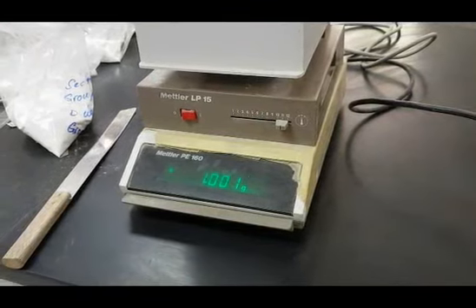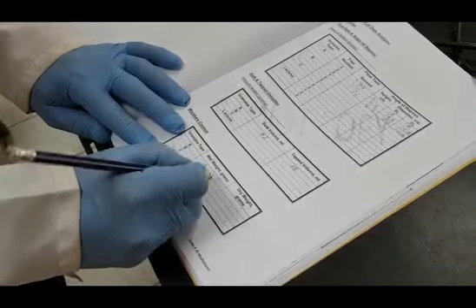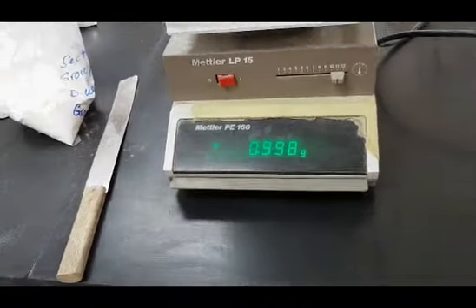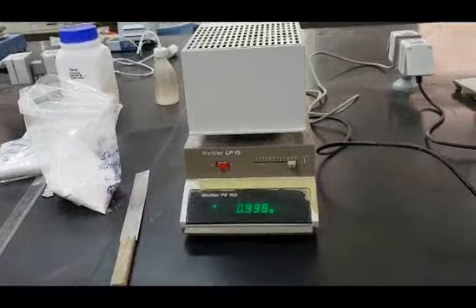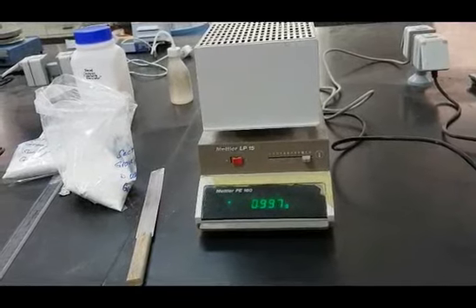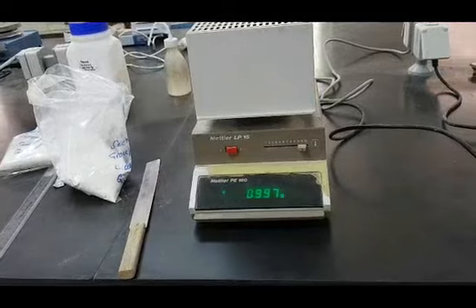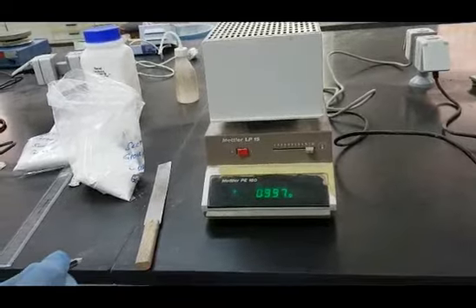Record this number as the wet weight. Now, allow your sample to dry. As you can see, the weight is decreasing, indicating the loss of water, evaporation of water. Continue drying till a constant weight is achieved. How to know that a constant weight is achieved?